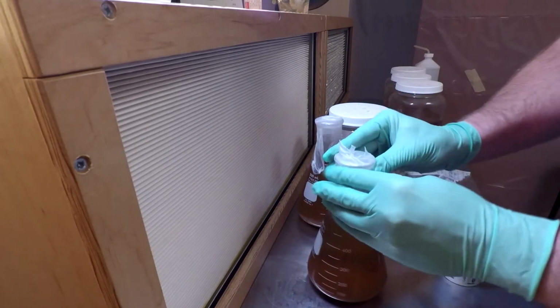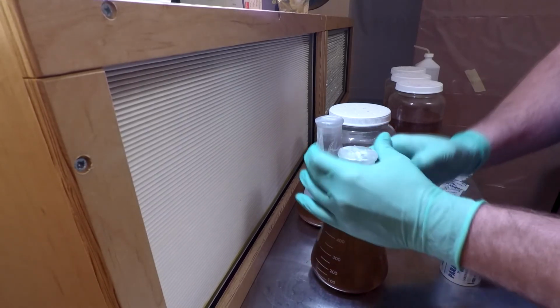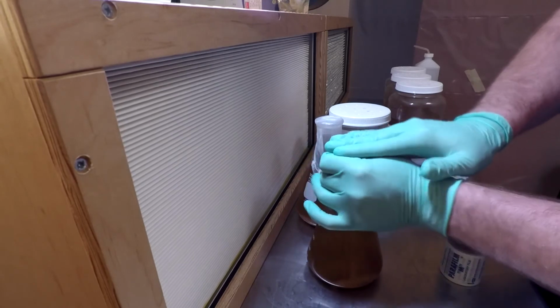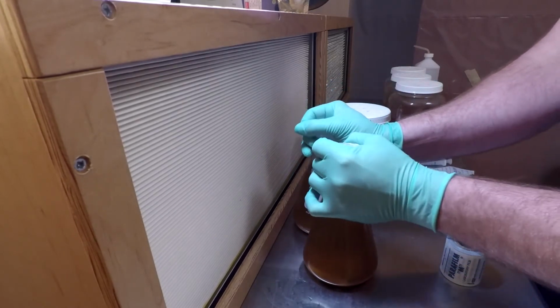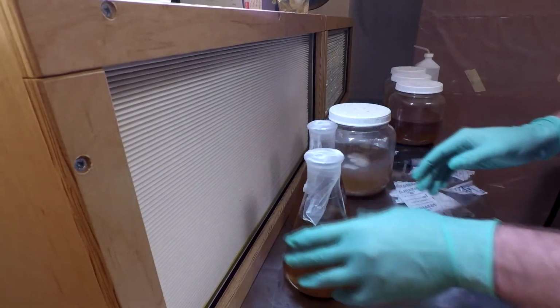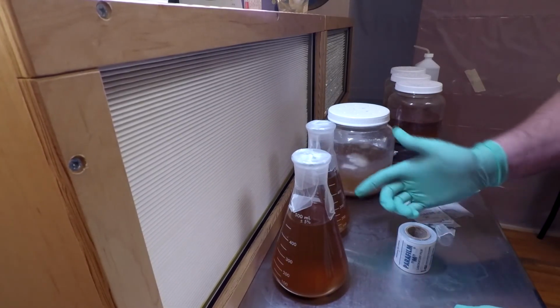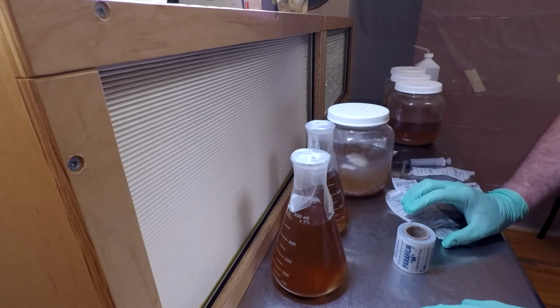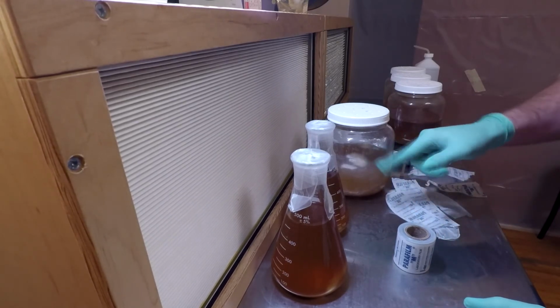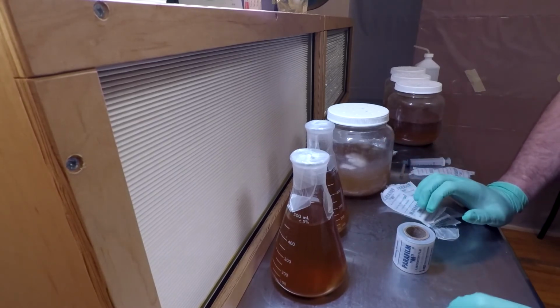Chilly in my lab room today. That's why this film is a bit stiff. That's why it wants to break on me. All right. Then it'll take the same amount of time to get these going as it did this one. And then I'll have, you know, for every 12 bags of grain I make, I need an entire jar. So I'm going to be making a lot of liquid culture to do nothing but grain bags.